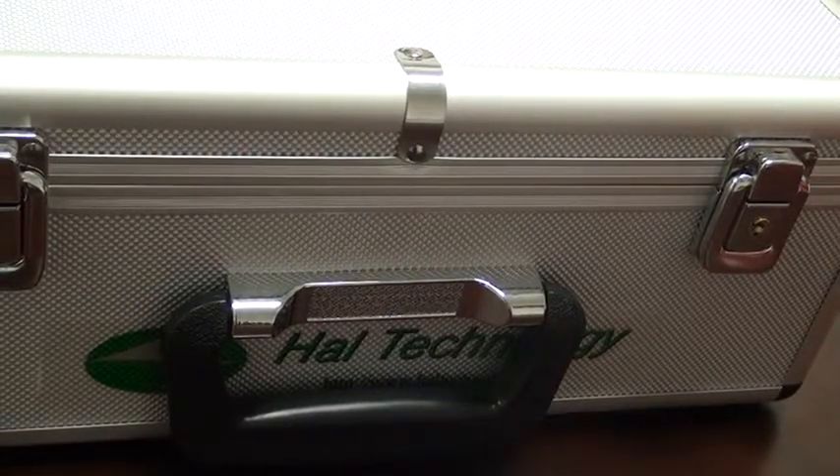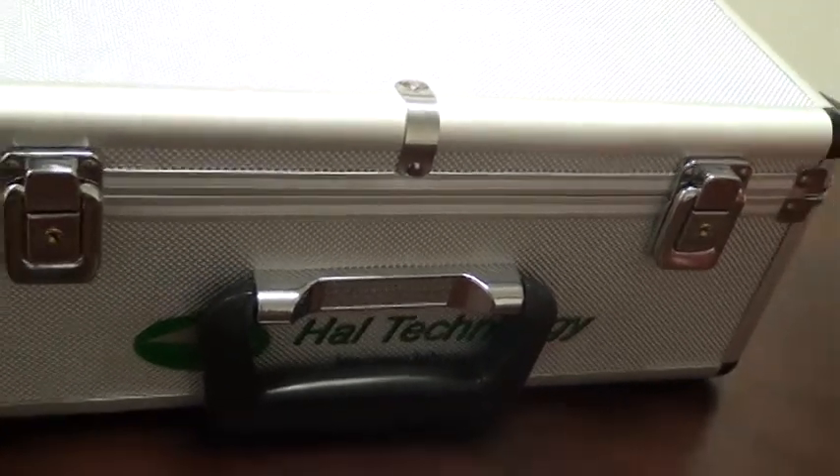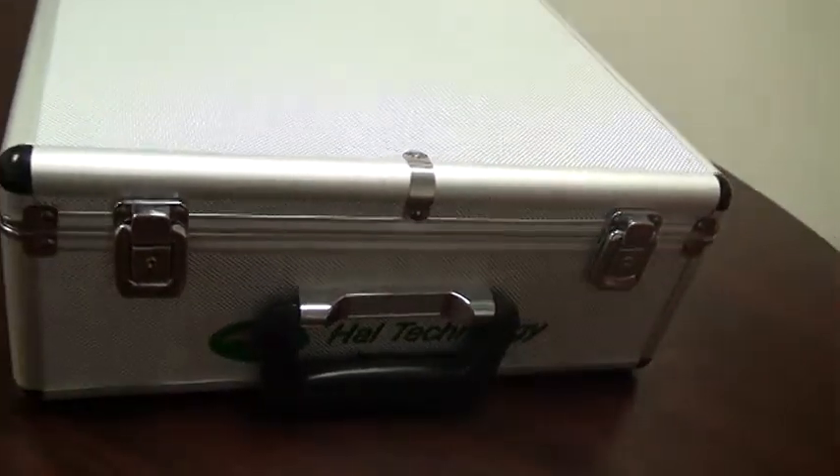This video will discuss the features and briefly touch on the operation of the HAL Technology HPC-600 Handheld Particle Counter.